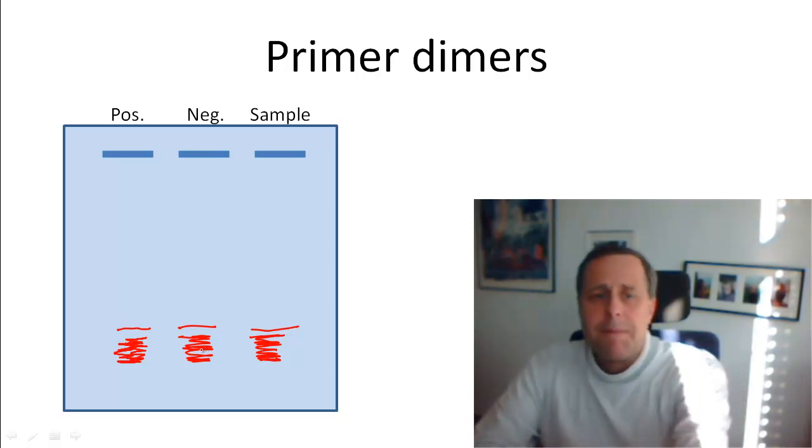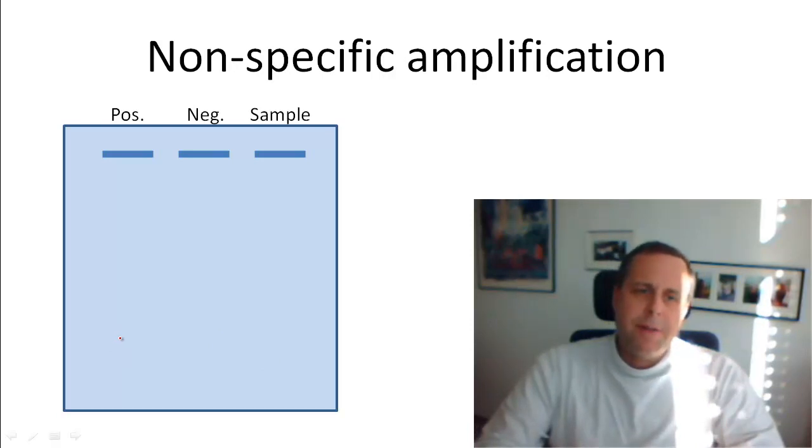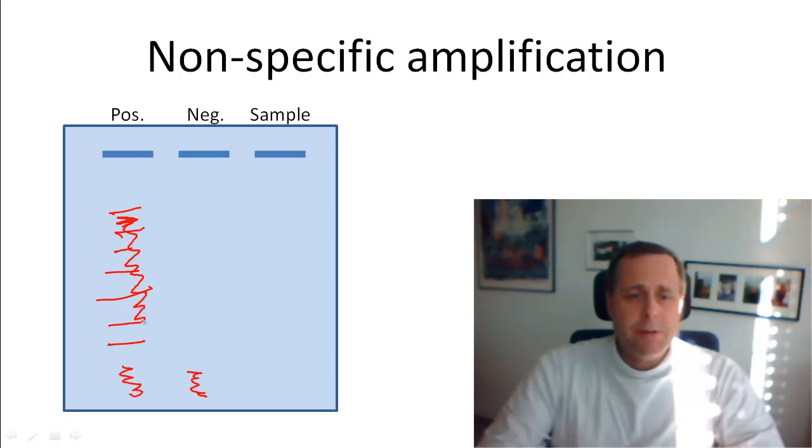Another kind of trouble that can come up is that you not only get the primer dimers, but you get all kinds of nonspecific amplification products. Maybe you don't get them in your negative samples. In your negative sample, you only get the primers themselves, but in the positive control you get several bands, something like that. And sometimes the bands are so numerous that it even looks like a smear that goes across the entire gel.